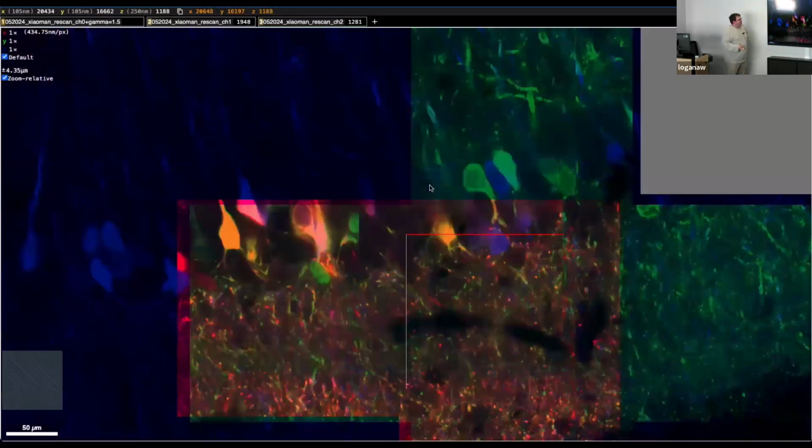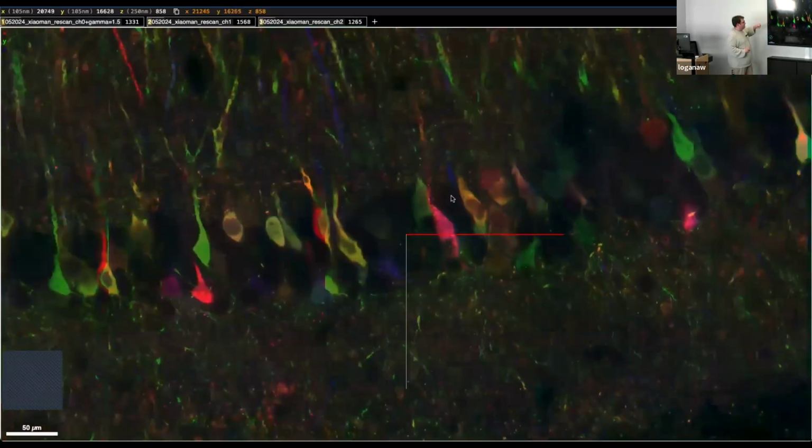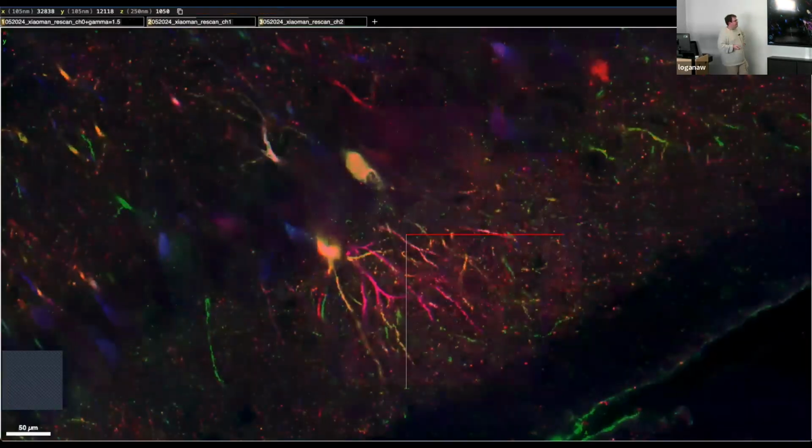So this is the same data set as the video that wouldn't work earlier. This is the rainbow data set. Here I'm stress testing it, jumping around in the Z dimension. I apologize if the flashing is troublesome. And you can see you can zoom out, zoom in, and you can see single cell level data, and it loads in relatively quickly. But then you zoom out, and you can see the whole tissue, kind of like a Google Maps type of view. I keep using that analogy.